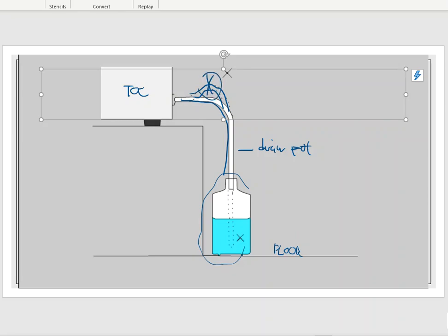So you do not want to do this. You want to make sure that that drain hose is pointed somewhat straight down. You do not want any kinks. You do not want any humps. You don't want any elevation in that tubing, because your instrument will not drain the proper way.